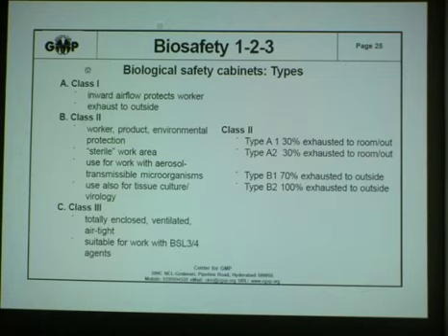You have them grouped or ranked as class 1, class 2 and class 3. A class 1 provides inward airflow to protect the operator, and all the air that is drawn in from the laboratory environment is exhausted outside with or without a HEPA filter, depending on the nature of the work and the risk perception.